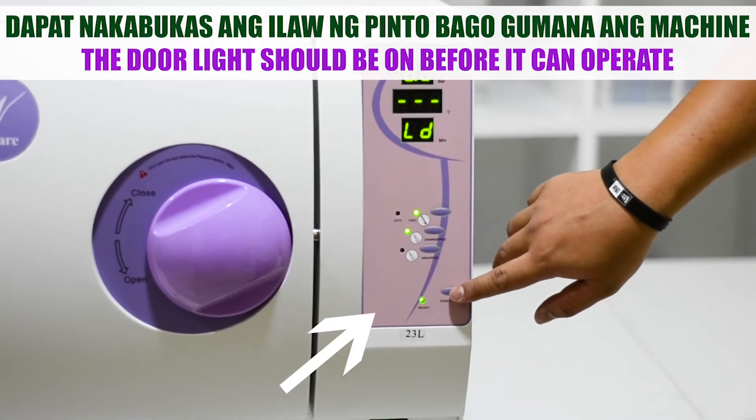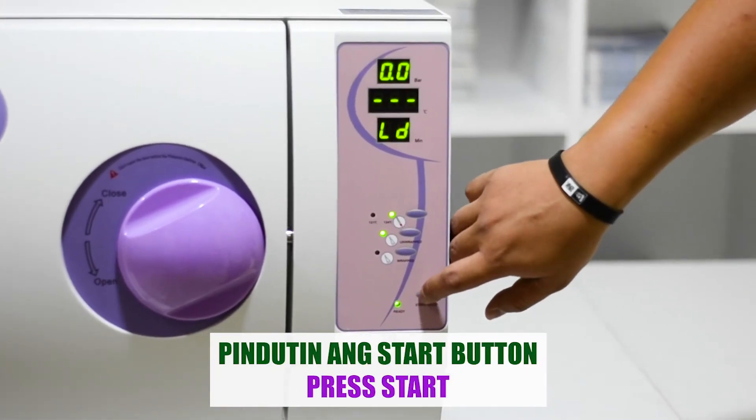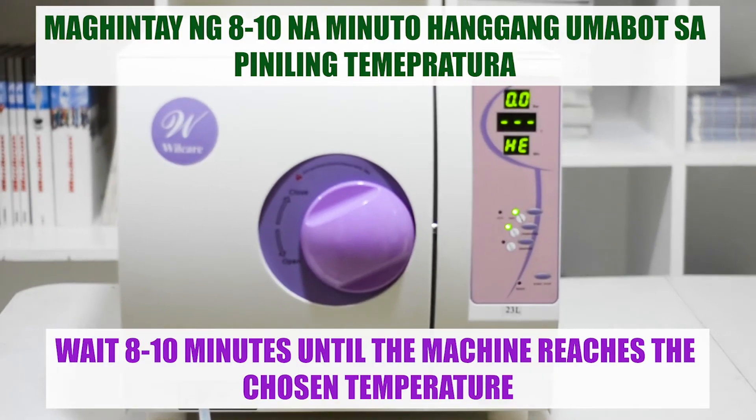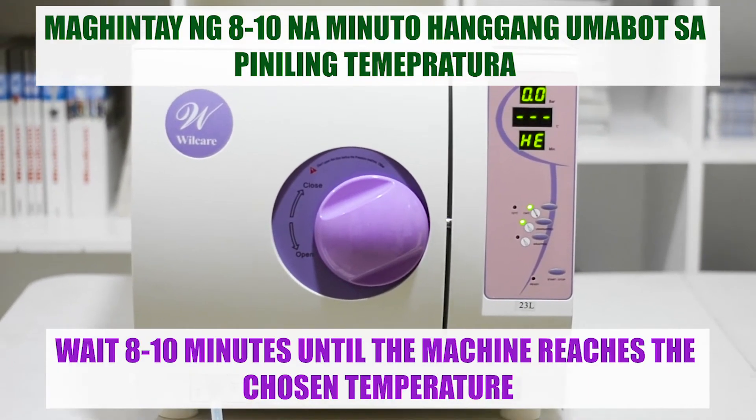The door light should be on before the machine can operate. Finally, press start. Wait 8 to 10 minutes until the machine reaches your desired temperature.